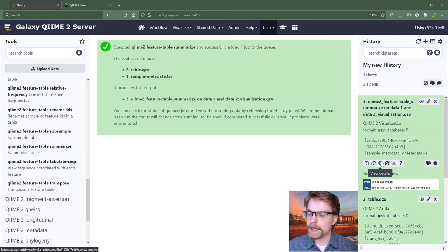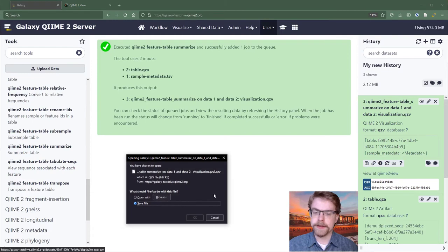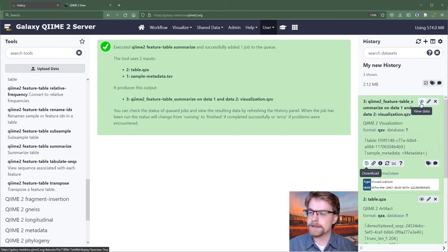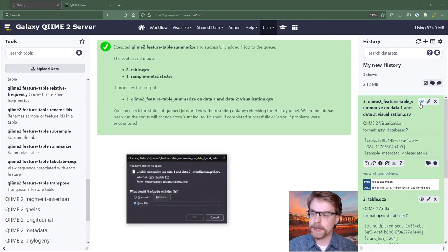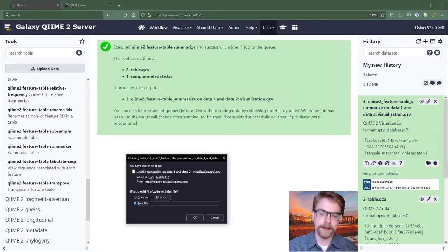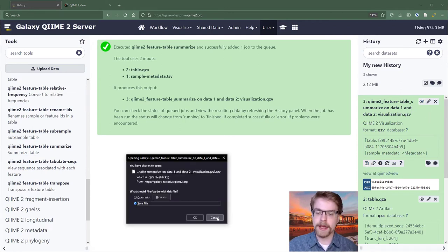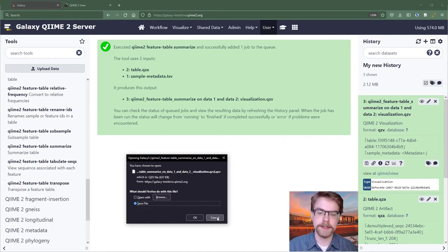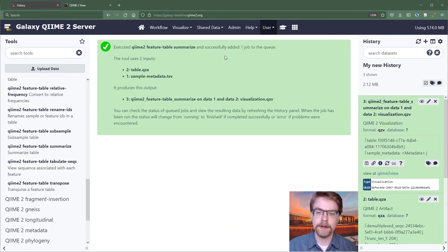We can also download this data. So if I were to download it, I would get this little dialog. Similarly, if I press this little eyeball, view data, we get a download dialog as well. In the future, that might change. But for now, this is the extent to which Galaxy knows how to interact with a QZV.